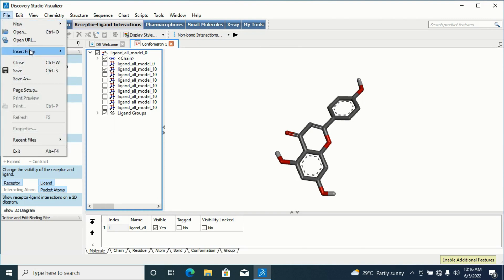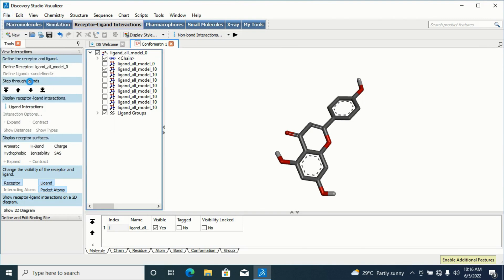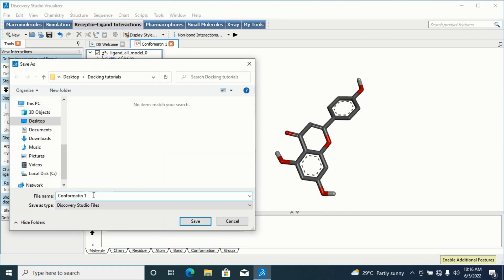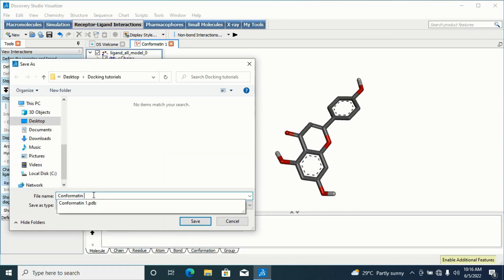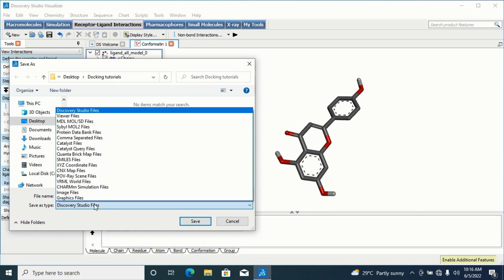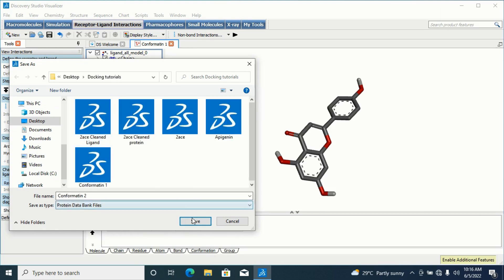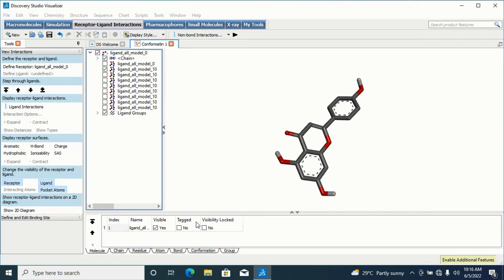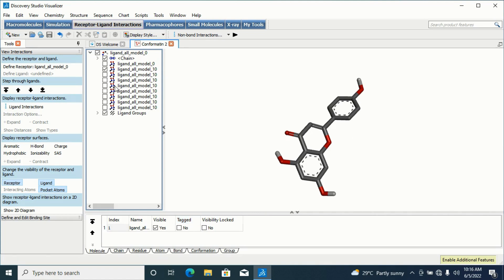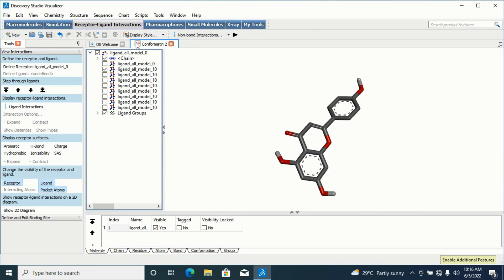Now let me save the second conformation. I'll go to File, go to Save As, and type the title 'Conformation 2'. I'll change the file type to PDB format and hit Save. You can save all of them and later check the interactions. For the sake of this tutorial I'll just make use of these first two.